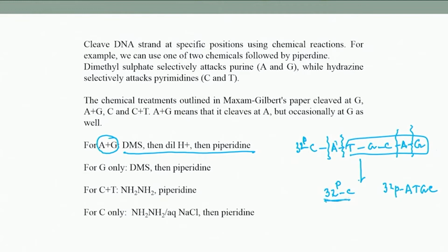So, this is one cleavage product you will get, another cleavage product you will get, and then you will also get the cleavage products from the cleavage of G. That means you will get C, then A, then T, then there will be cleavage of all these G product G.